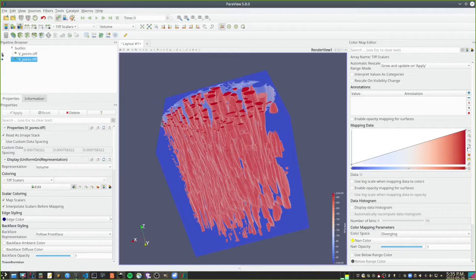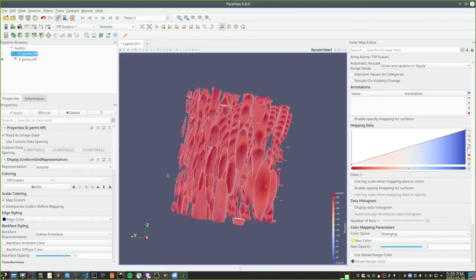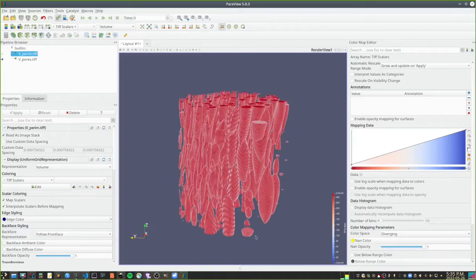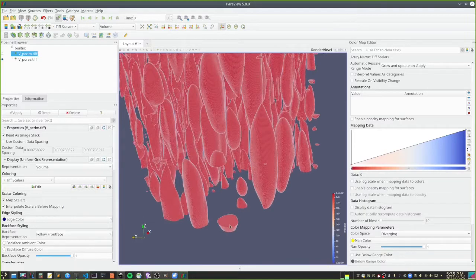Yeah, there's a bit of a bug: it shows you the pores even though they're behind the perimeter. This is not very reliable, but the majority of these are fine. Some of them are cut, like this one down here, but this might still be fine, because if it starts touching the edge, then it's going to be considered perimeter.